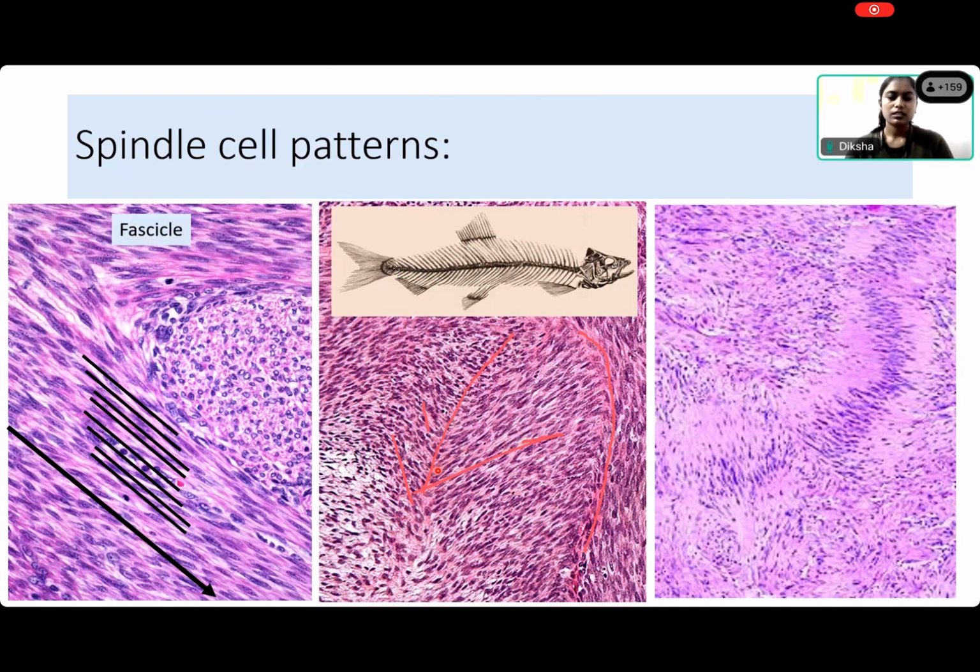Now you can see that these are all the different ribs of that fish that are being deflected away from this thing. So very good. So this is a herringbone pattern. Now I think I have a thing here that you can show. So that was the spine of the fish, and these are the deflection of the ribs, I mean, they're bones, obviously, of the fish. So that is a herringbone pattern.